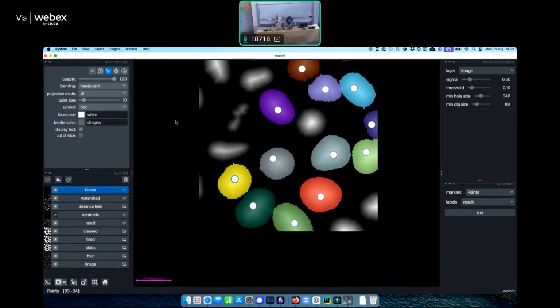There are plugins out there and various tools so that you can annotate in 3D based on multiple layers, for example, by selecting an image layer and saying, okay, now snap my points to the maximum value on that image layer and stuff like that. But none of this is built into Napari.